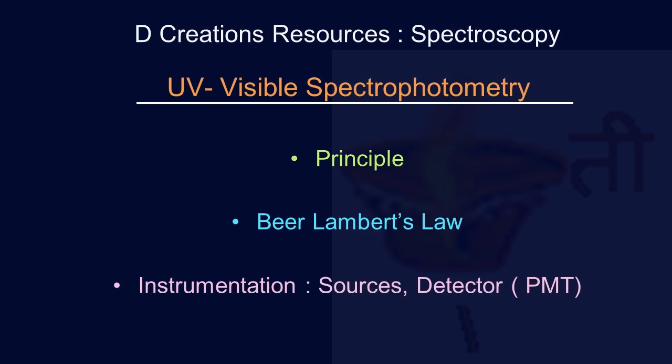Now the range required, of course, is from 400 to around 750 nanometer, and the reason why halogen gas is also used here is because it extends the life of the filament. So when tungsten evaporates because of high heat, the halogen gas will react with it, and it will redeposit tungsten back onto the filament.